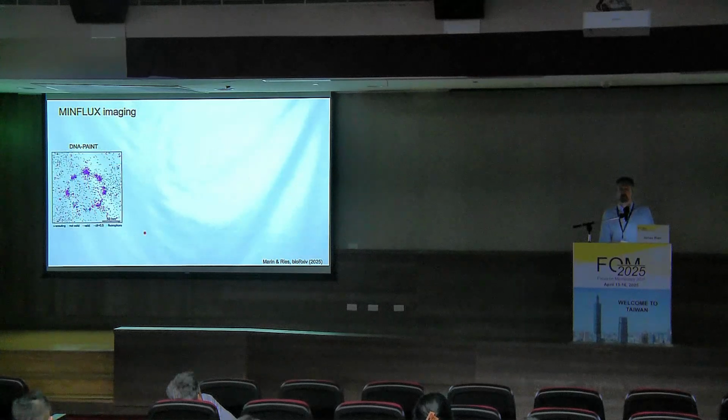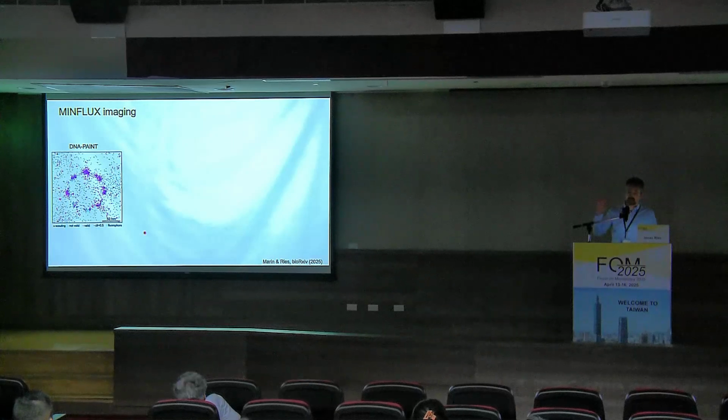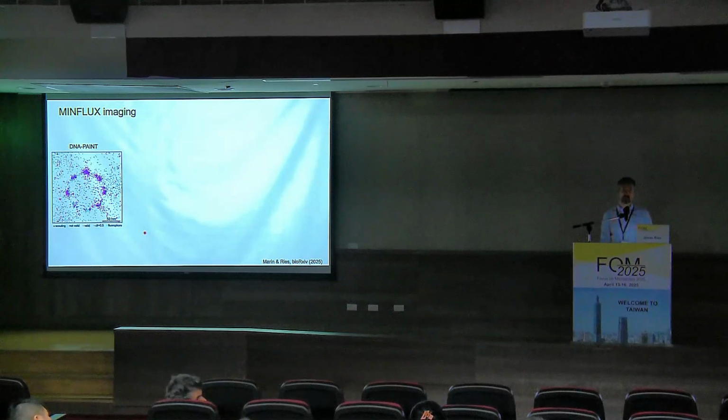So next we simulated MINFLUX imaging, and it is now becoming more and more common to use DNA-PAINT for MINFLUX. The reason is, again, the ease of doing sequential multicolor imaging, but also the large number of photons that we detect in each event. However, the imaging strands are still bright. They diffuse around, and they diffuse on a time scale and spatial scale similar to our pattern scan. So within microseconds, the intensity can change because an imaging strand diffuses by.